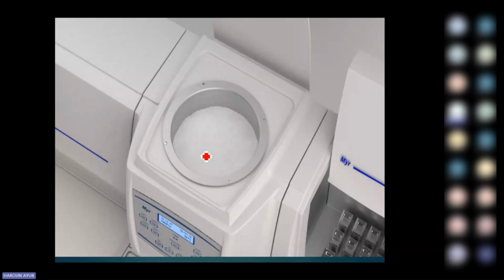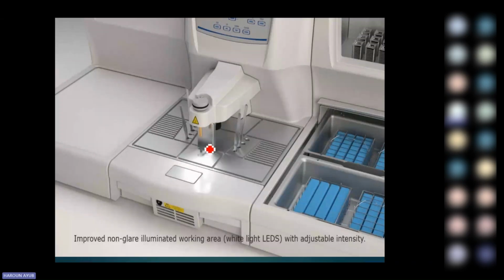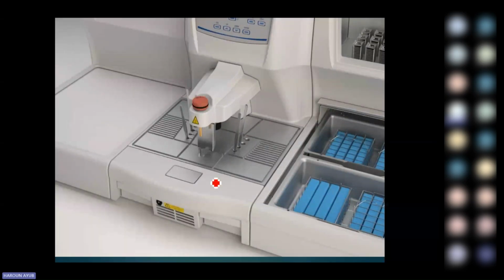You have your switch plate here, but you can also have a foot pad switch if you wish. You can control the amount of wax you want by the nozzle, depending on which block you are working with. If you are working with very small blocks, you can have the minimum setting. If you have bigger blocks, you can increase the adjustment. So that's just the process for embedding, as Sarah had described earlier.